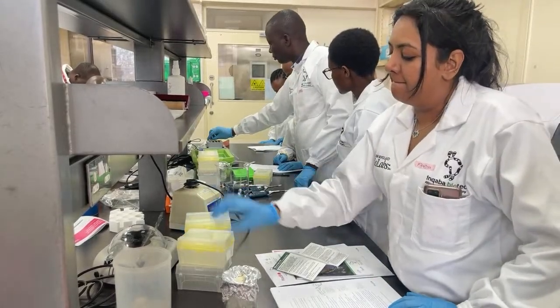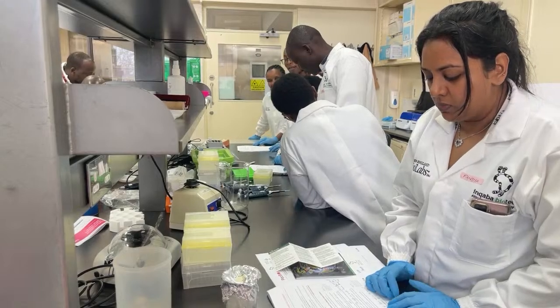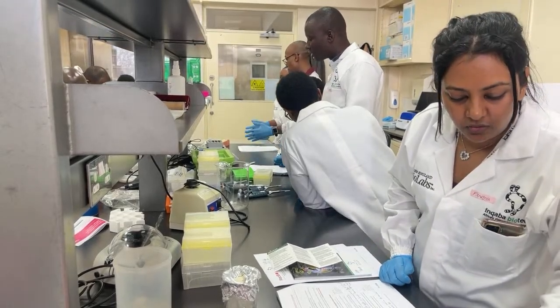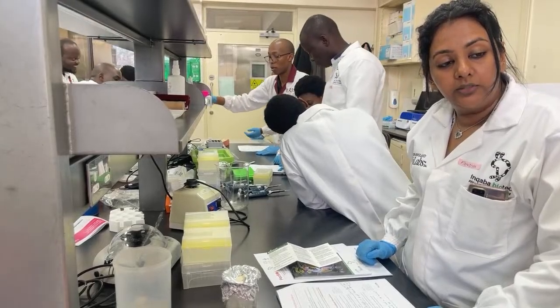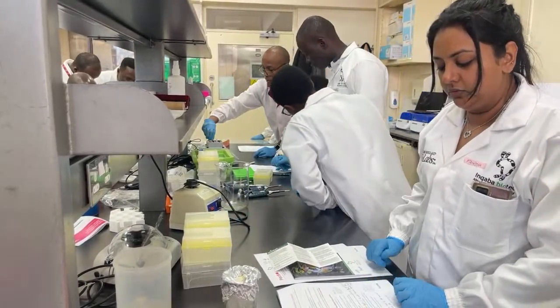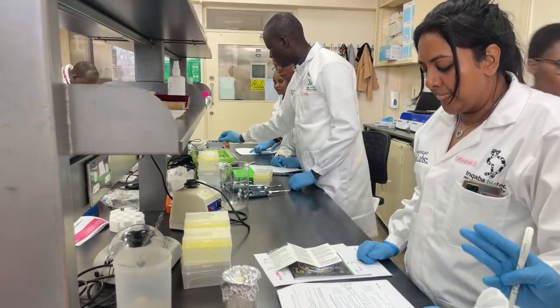Still trying to figure out what you are doing here. When you did this one, you did half of the step for Mona. What's the use of this buffer CT? It's for lysis. You took out the buffer and poured it out. No, we just added the buffer for lysis. So the pellet was left inside the tissue, because you discarded it. So it's like you're having two different steps of lysing.